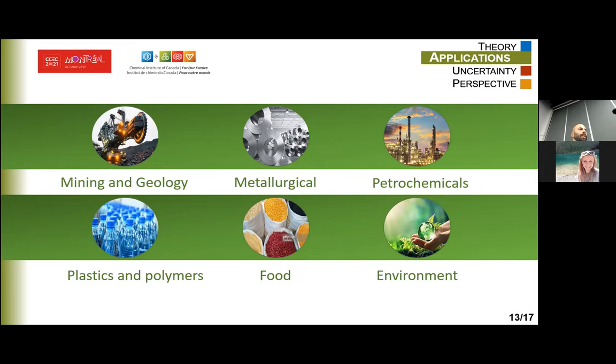In petrochemicals, it's used to look for sulfur and other metals that can be a problem in your products, in your oil or in your lubricants, and so on. It depends on what you need.